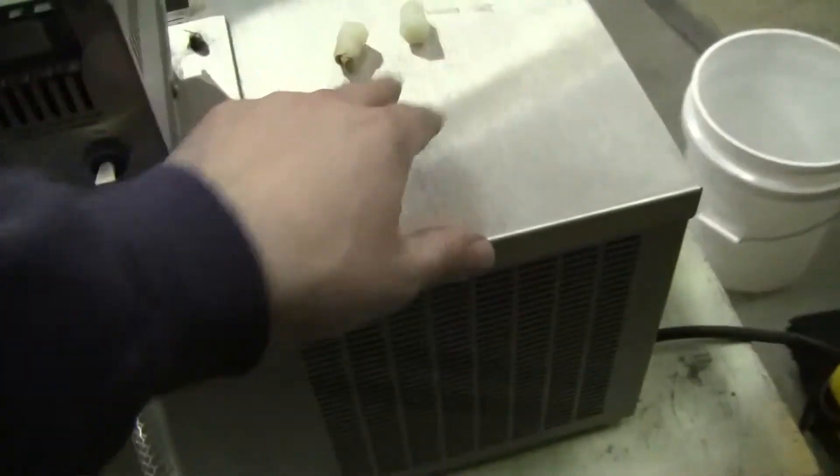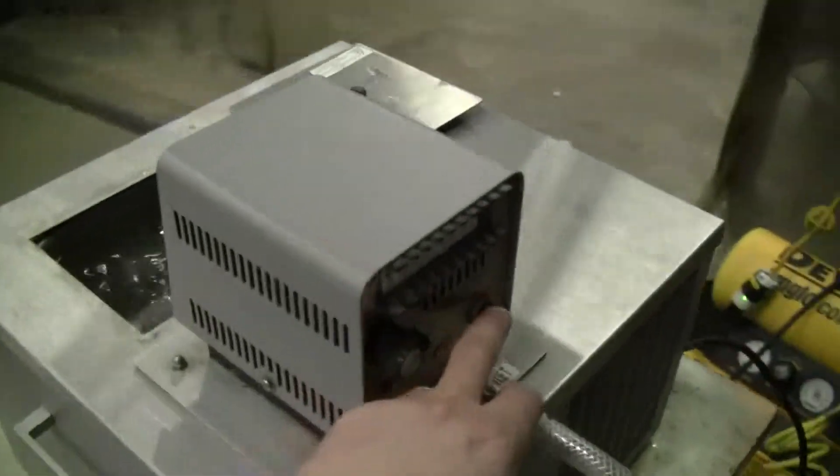And the fittings are our fittings. Sorry, you're going to need your own fittings. Thank you from Hitech Trader.